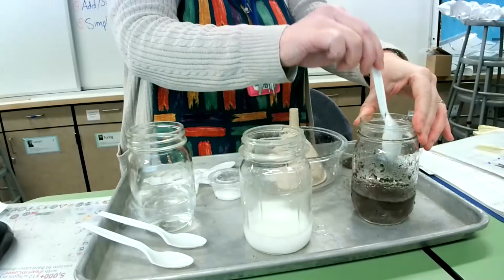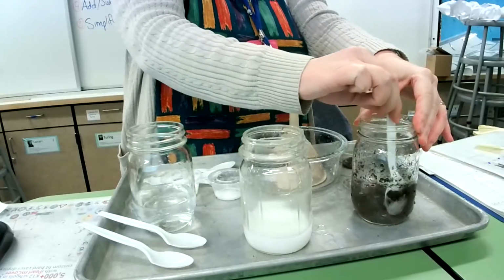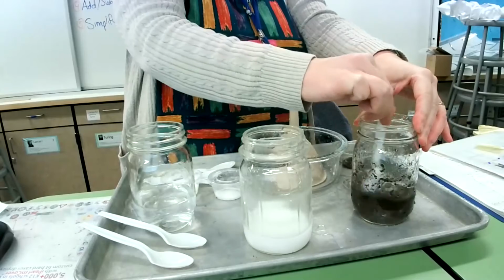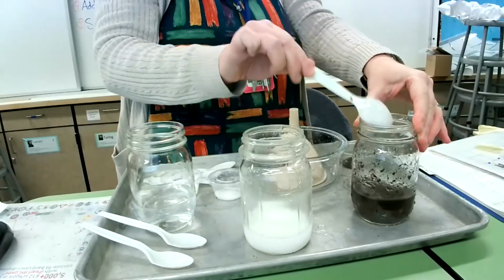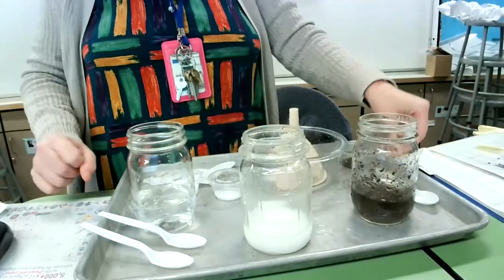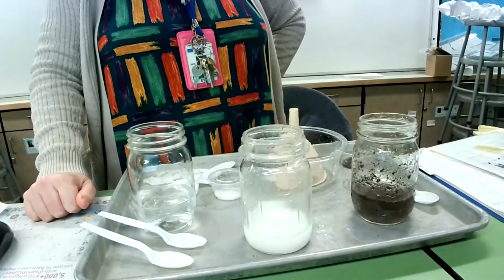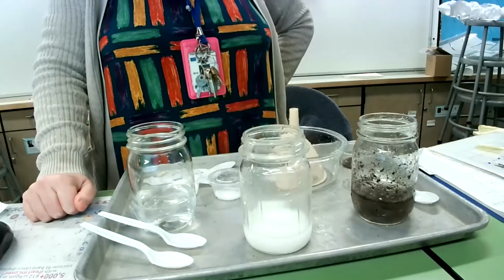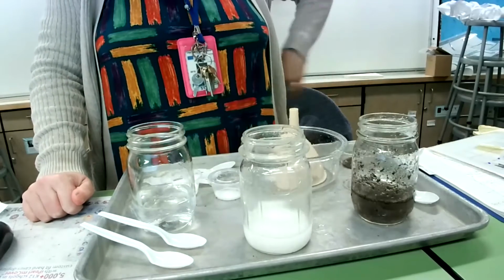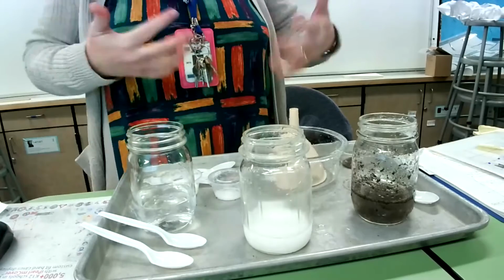And let that swirl around a little bit more. I'm going to stir it more. And I'm just going to kind of let that settle. And you can see right away that the dirt and the sand and the little white pieces that are vermiculite, they're really lightweight things that are added to soil to aerate it a little bit.